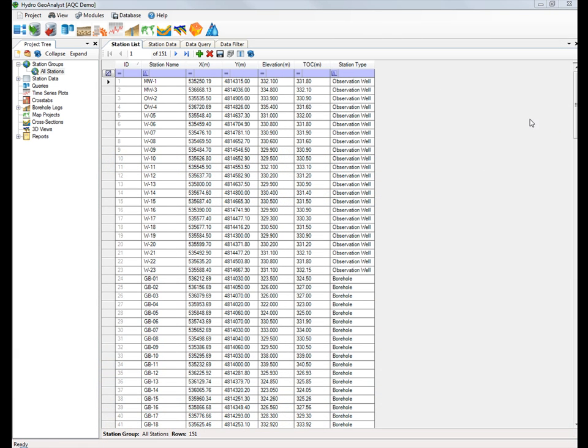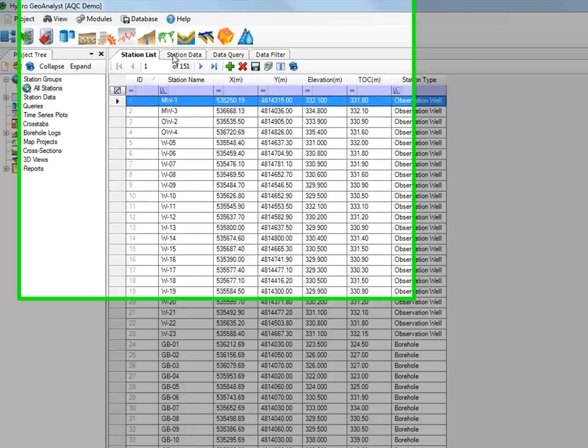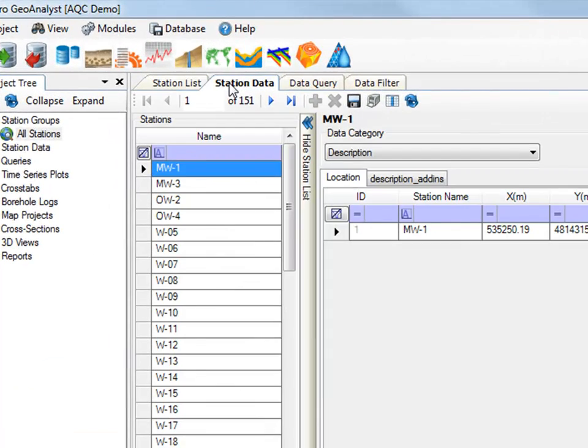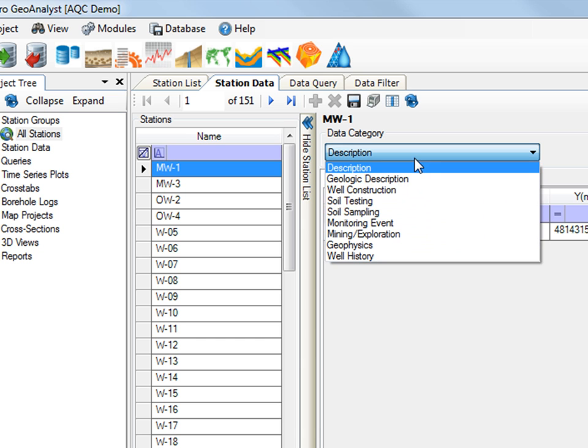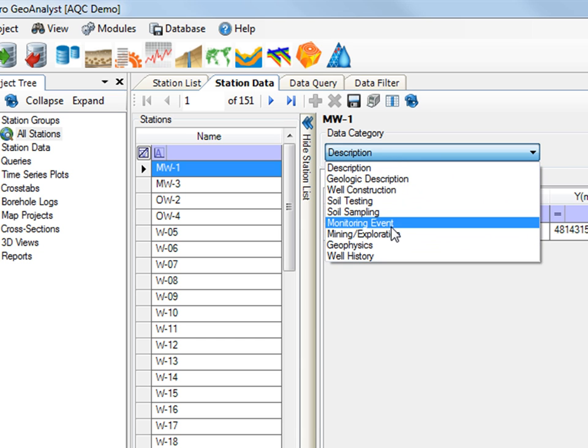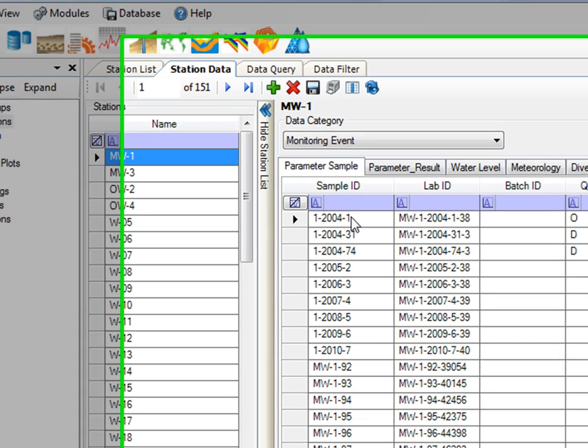Today we're going to show you how you can link HGA and AquaChem together. Here is an example HGA project where I've entered in some stations and I can look at some of the station data.